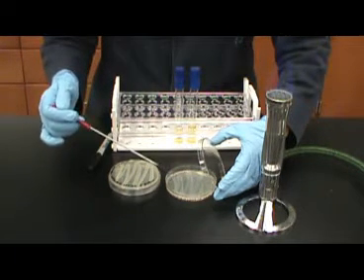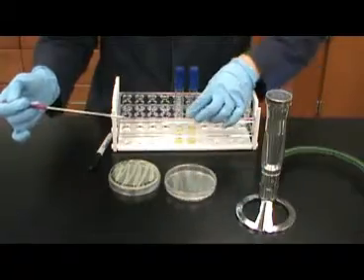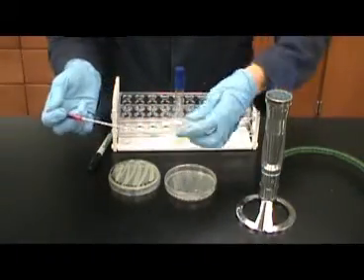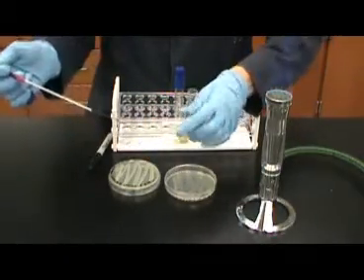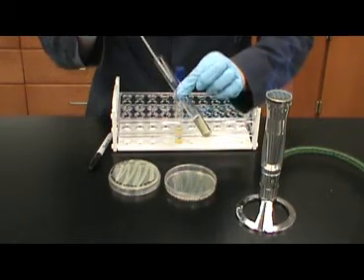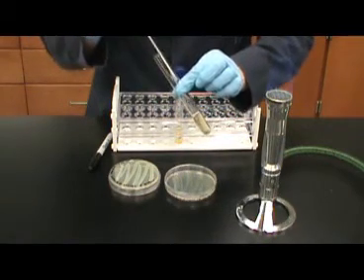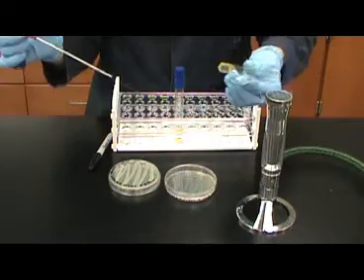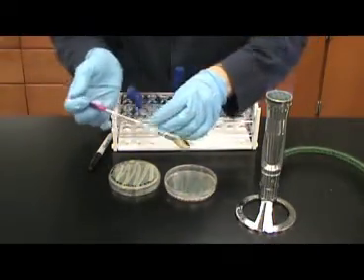For this media, gelatin is used as the solidifying agent instead of agar. The inoculation is a simple stab inoculation. However, you should use a loop instead of a needle. You will need an ample amount of bacteria for this test to obtain the best results.